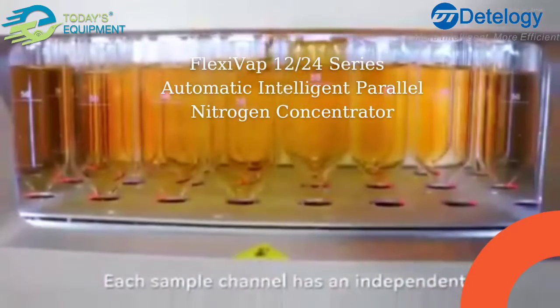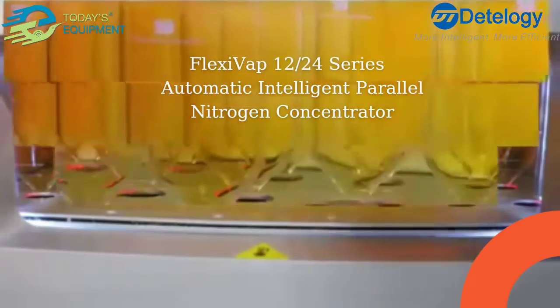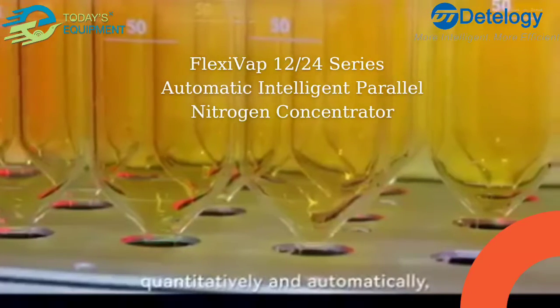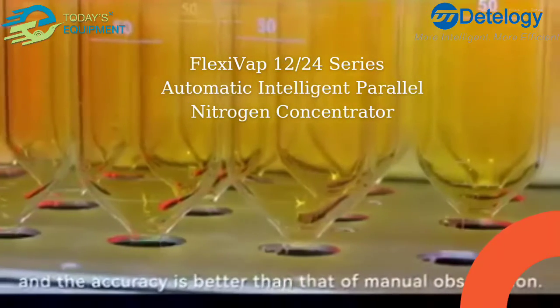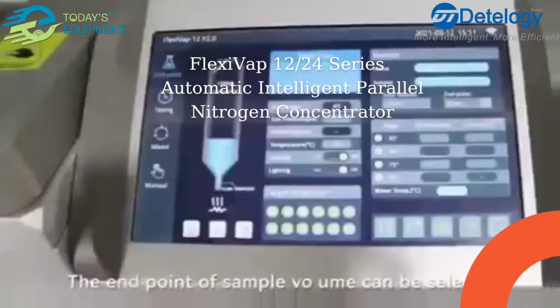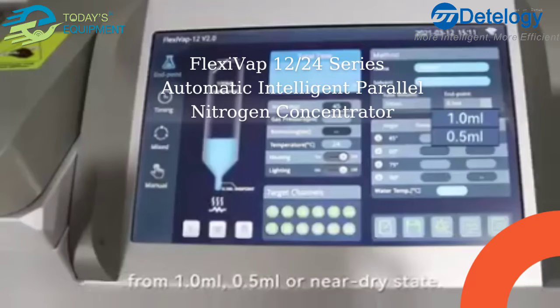Each sample channel has an independent infrared fiber optic liquid level sensor. The sensor can concentrate the sample quantitatively and automatically, with accuracy better than manual observation. The endpoint sample volume can be selected from 1 milliliter, 0.5 milliliters, or near dry state.